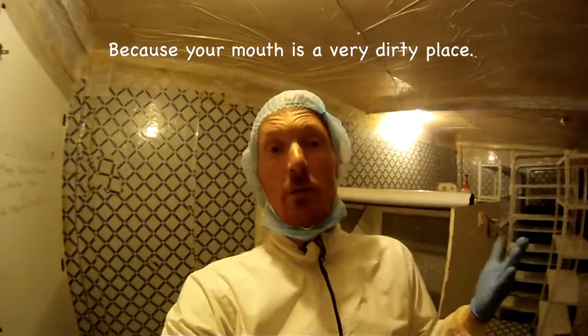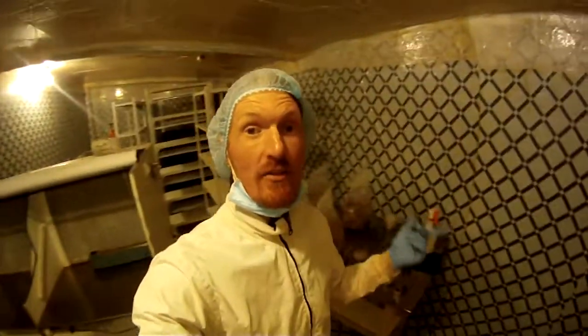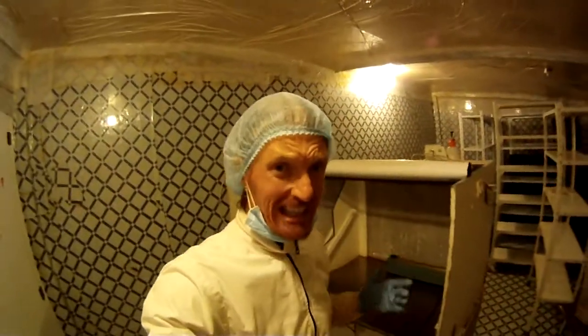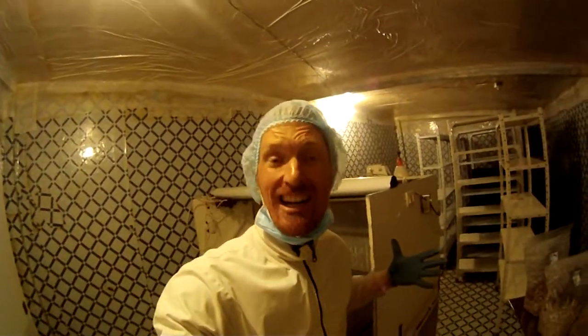I'm going to show you the components and give you a quick tour of what it entails. Normally I would not talk in here - it's very weird for me to be talking in here. I don't have a whole lot of stuff going on right now to compromise. We're doing a big clean, so this is a good opportunity to show you guys around and actually talk inside.